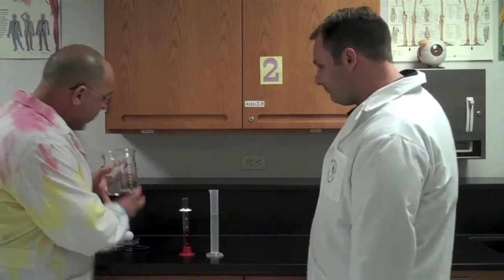This is a glass graduated cylinder. It goes up to 50 milliliters. This is a plastic graduated cylinder. It goes up to 100 milliliters. Both can measure volume, they're just different sizes and different shapes. We measure liquid volume using milliliters. That is our unit.